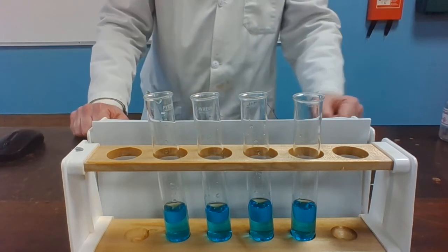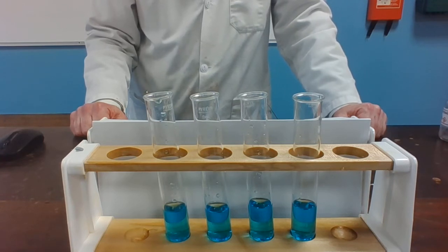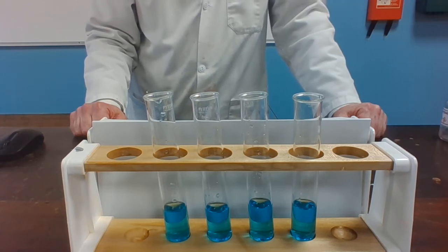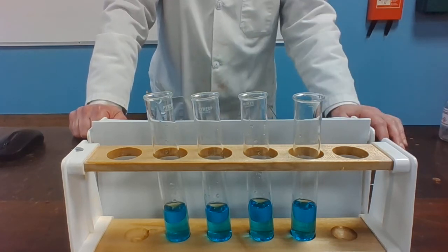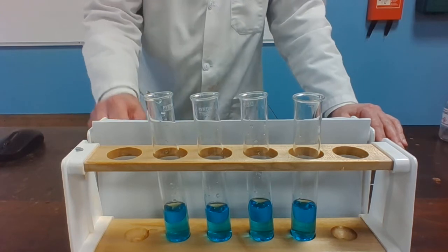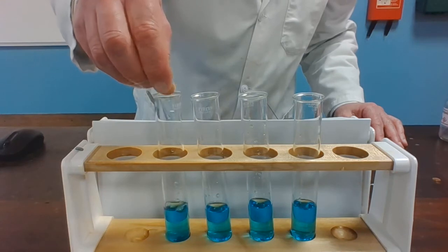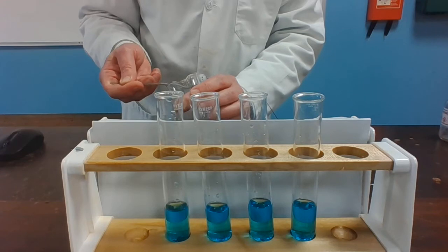We will now look at some displacement reactions. In the four boiling tubes you can see there, we have copper sulfate solution, and to the copper sulfate solution I'm going to add lead, iron, zinc, and magnesium. We're looking for any evidence that copper has been displaced — copper is a red-brown solid. So into the first tube some lead foil. Into the second tube some iron filings.